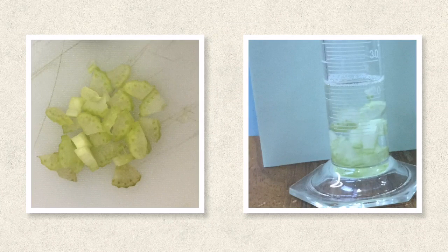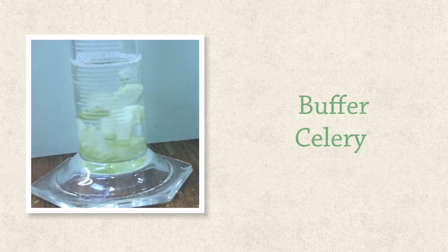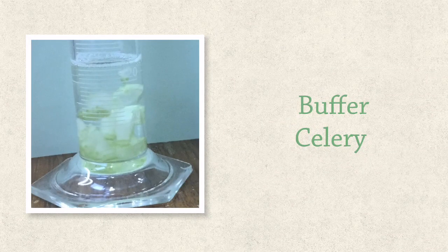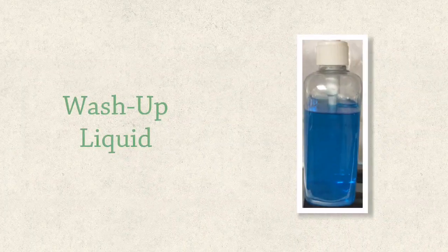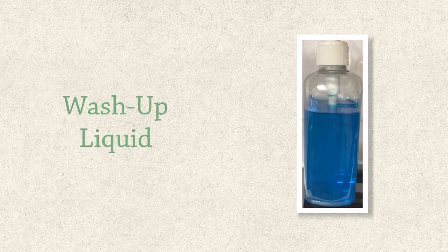5g of freshly chopped celery was added to our graduated cylinder and also the desired buffer solution 20cc. So here we have our graduated cylinder all ready to go with the buffer solution and the celery. To this, 2 drops of washing up liquid is added and the purpose of the washing up liquid is to catch the oxygen being released and to create a foam.